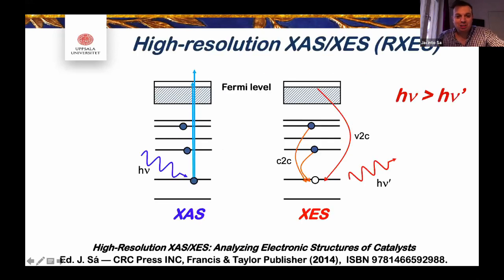Without too much delay, we are using X-rays as a way to measure chemistry, and primarily I'm interested in 5d and 3d elements, which are quite ideal for, for example, doing X-ray absorption and X-ray emission in situ. And that's what attracted me to start using these techniques, the ability to look at reactions in real conditions, as my background was primarily heterogeneous catalysis. Also, with the appearance of the XFEL, we can look at these things not only in situ and in real conditions, but also in real time. So that's been the motivation to move into X-ray absorption and X-ray emission.